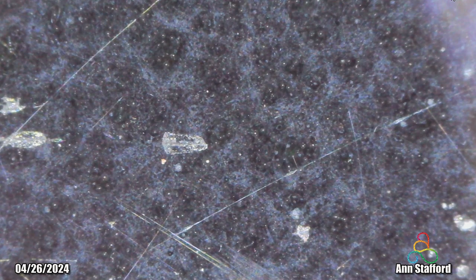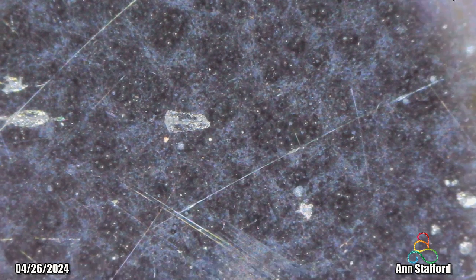Okay, so what I'm going to do, because I've jumped around the tray and shown that they're just all over the place, I'm going to take an index card or something and sweep or scrape everything into one little area. I'm going to pull everything towards the center, because driving this microscope around the tray is going to take hours. I can't do that. So I'm going to stop here, then pull everything towards the center of the tray, and I'll record that.